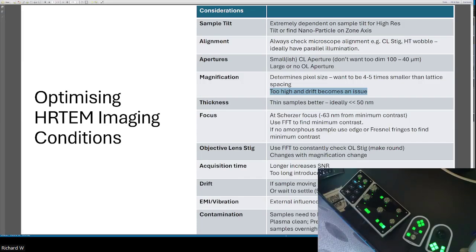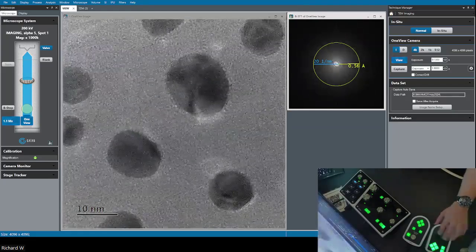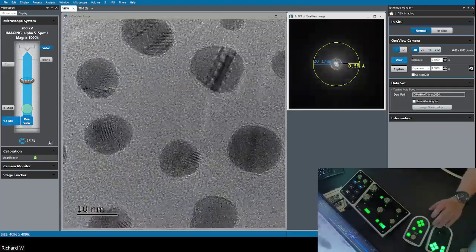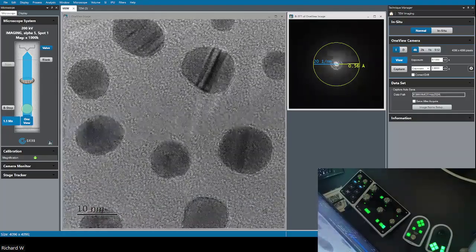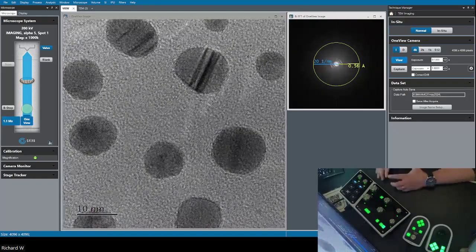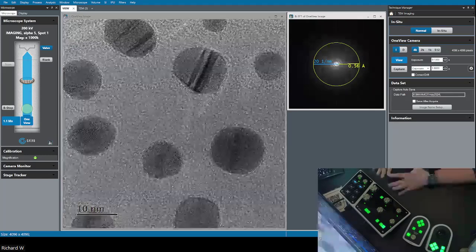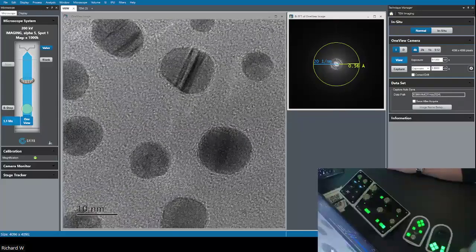So you can now see the sample is moving. If I move the sample a lot and move it back, then maybe we can see the sample is moving, right? Typically, after moving the sample in the microscope, we want to wait a little while to stop any residual movement or any backlash, which is causing this gradual drift towards the left. In this case it's towards the left, but it might be in a different direction.